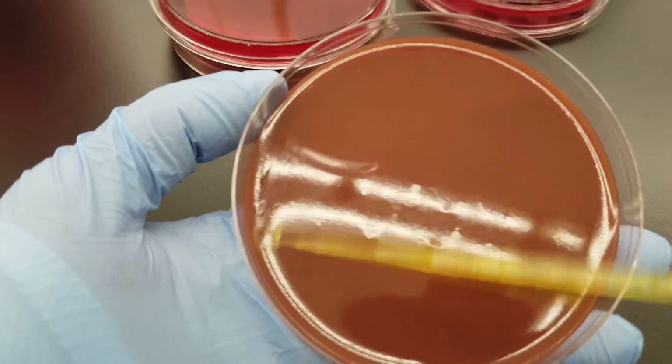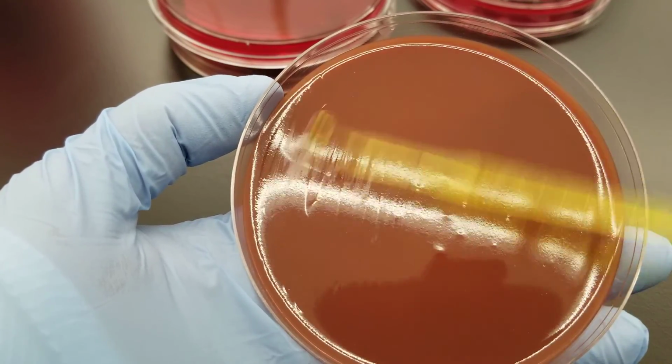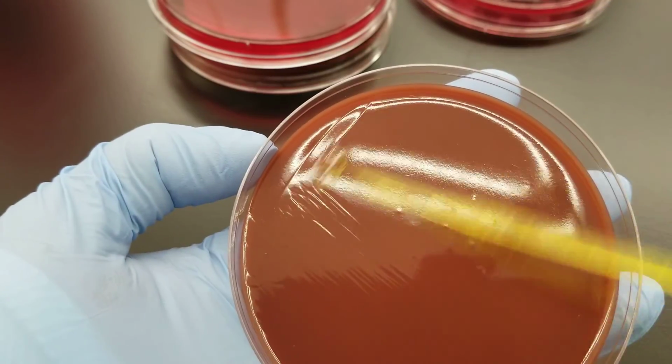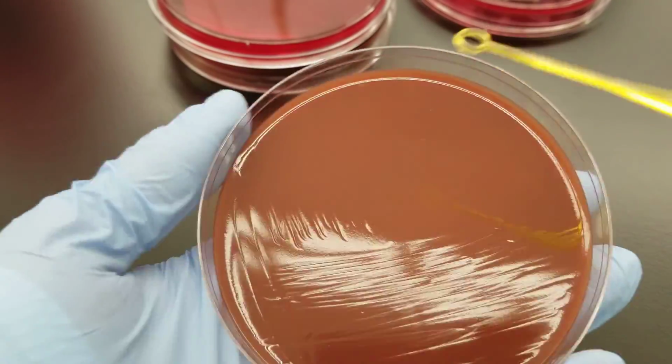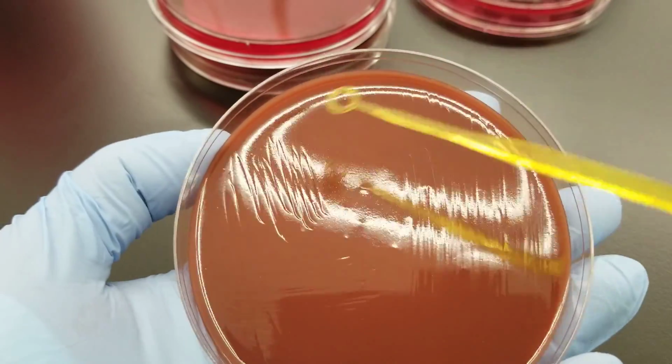And now I'm going to make my quadrants here. That's the first. This is the second, the third, and then the fourth.